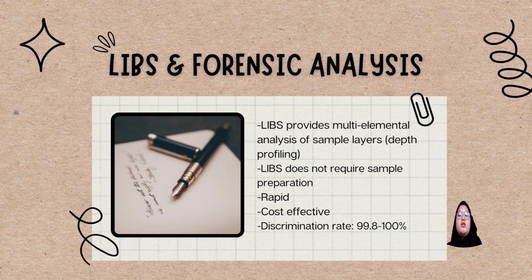In LIBS analysis of blue and black ballpoint pens, the obtained discrimination rate ranged from 99.8 to 100%, which was comparable with the more complex LA-ICP-MS approach.